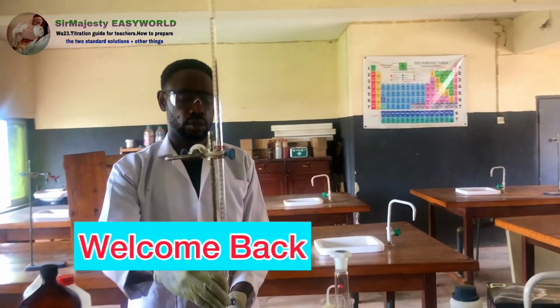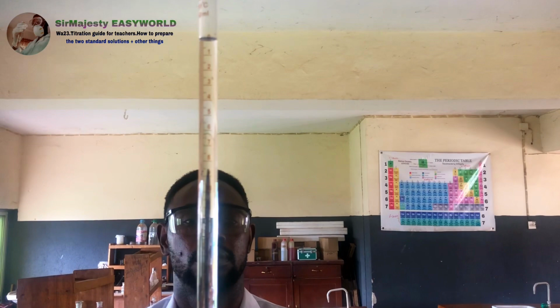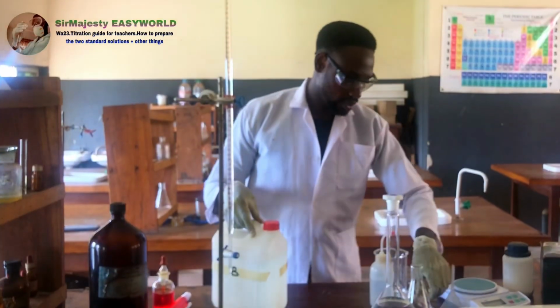The most advisable time to take your initial reading, let me turn this around so that the camera can read it. Okay. Captured. So the most appropriate time for you to take your initial burette reading is just before you start titrating.